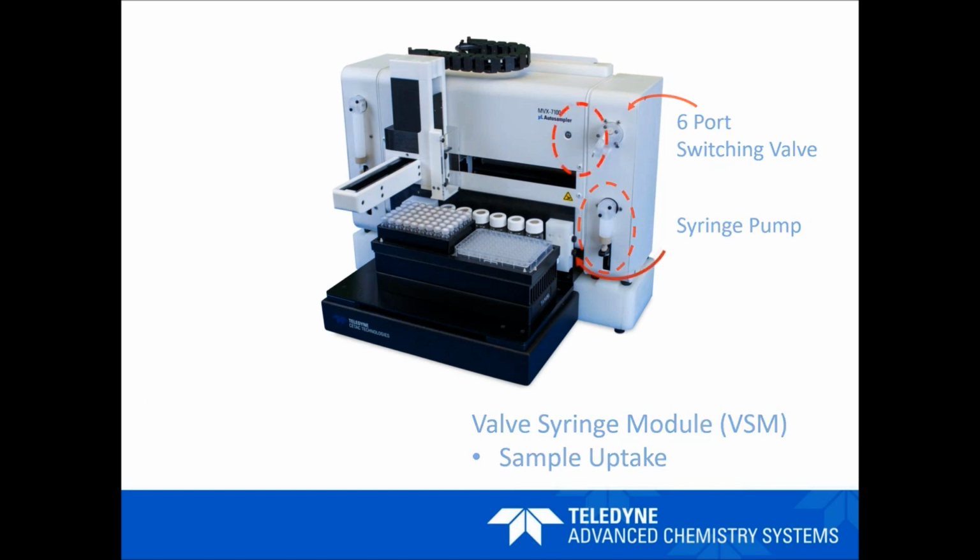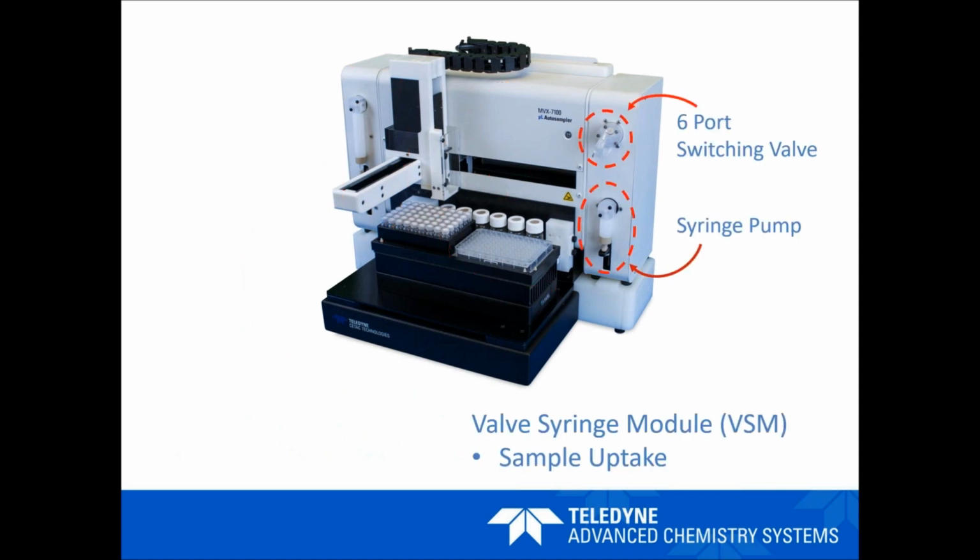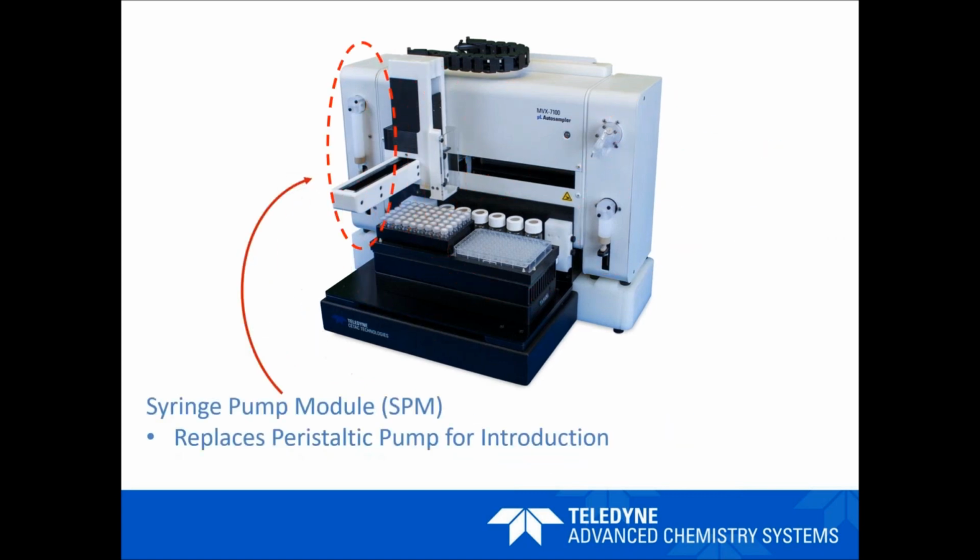After that, the next thing that happens is you will move to the other module. This is just a syringe pump module on the other side. There's a syringe pump here, which is a longer syringe, a longer pump. That is a 2.5 milliliter syringe in this case. Again, another PFA syringe with PEEK fittings.